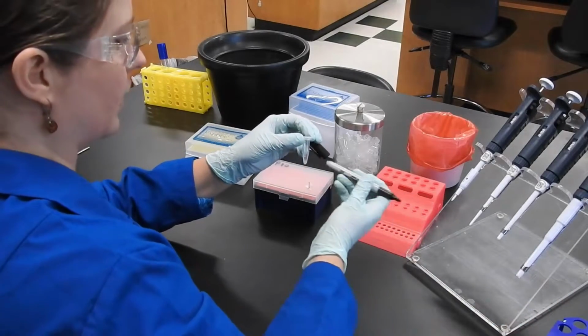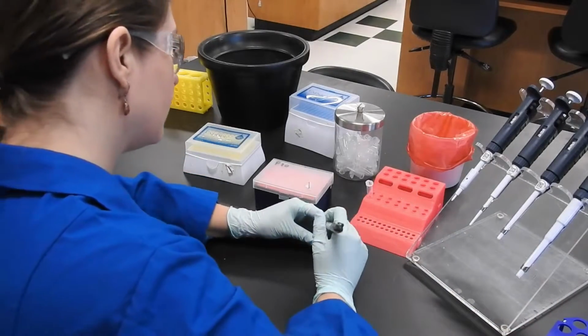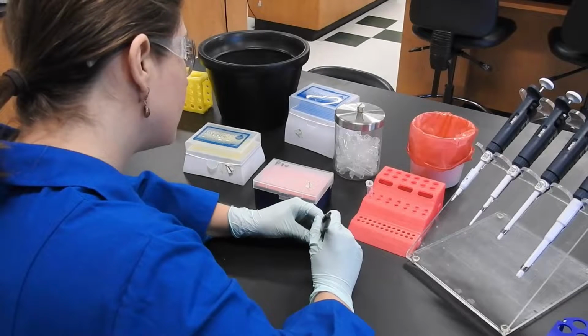This tube contains competent E. coli cells. I will label the tube with my initials so I can identify it later.